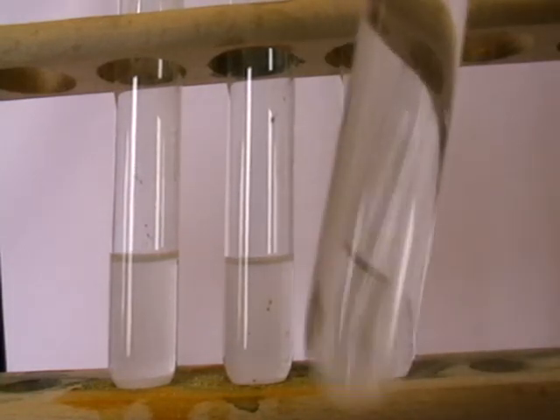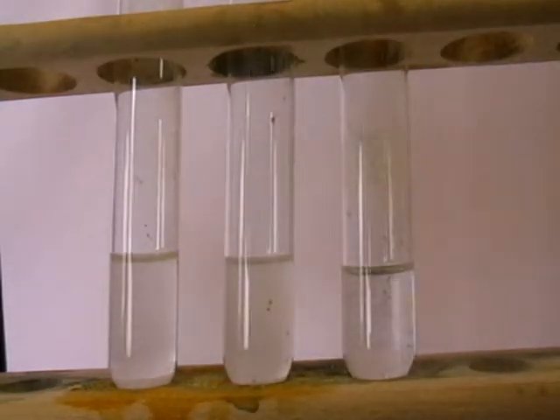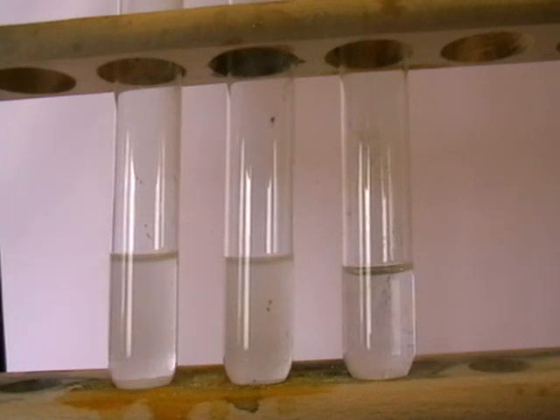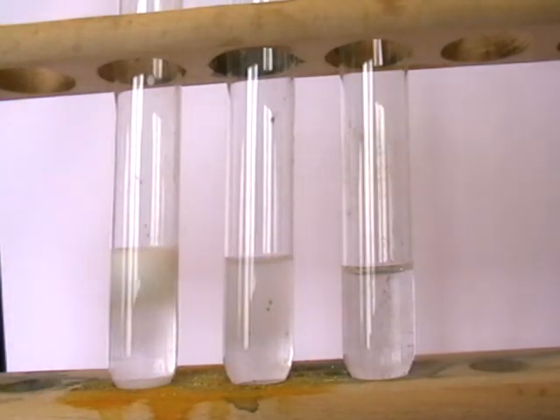I'm going to add now the acidified aqueous silver nitrate to each of these in turn. First of all, the one on the left here is sodium chloride solution. Just one or two drops to begin with. And you should observe there the formation of a white precipitate.